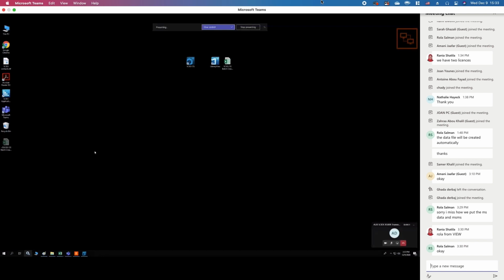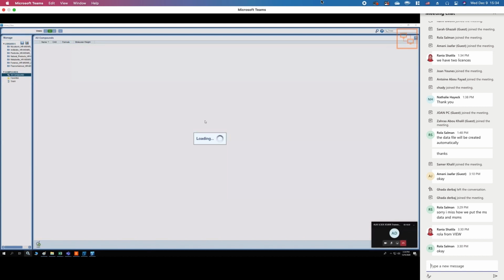So you have a software called Library View. Yep, here it is right here. So we'll just check in the Library View. That is the condition of the library. Library View is a bit slow. It takes a second to open. It didn't open on the other window, did it? Maybe I didn't click. Yeah, okay. All right.